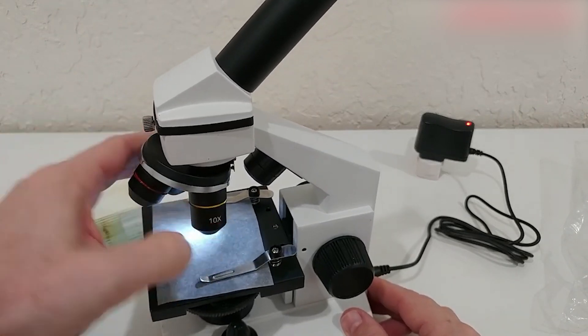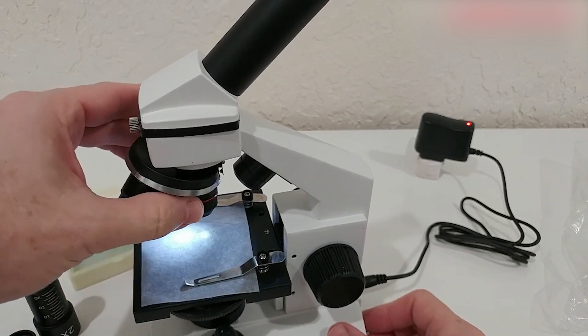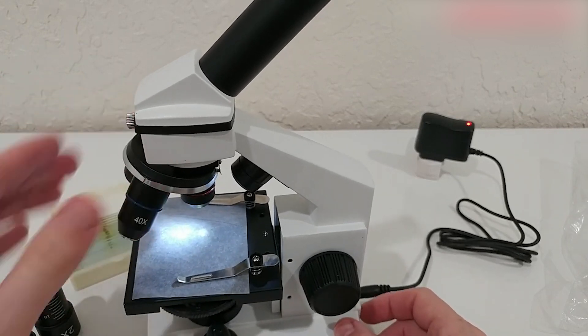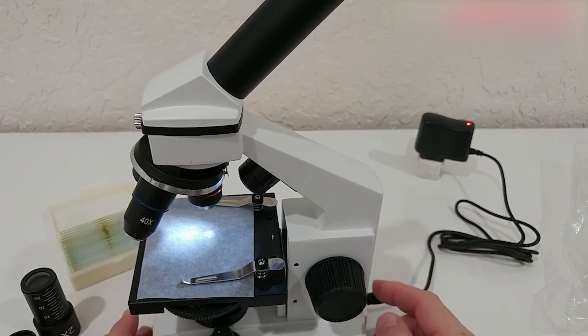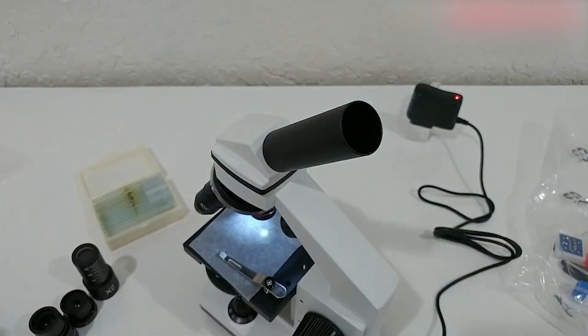This comprehensive accessory package ensures you have everything you need to start your exploration right out of the box. Whether you're in a school laboratory, at home, or on the go, you'll have all the tools necessary to delve into the world of biology.